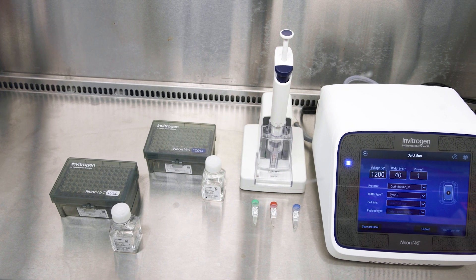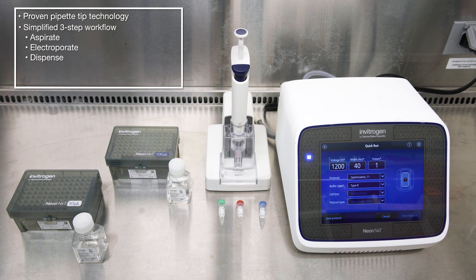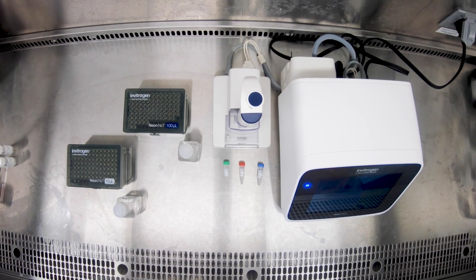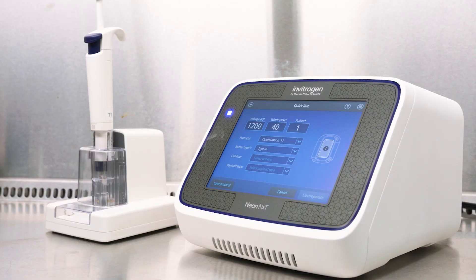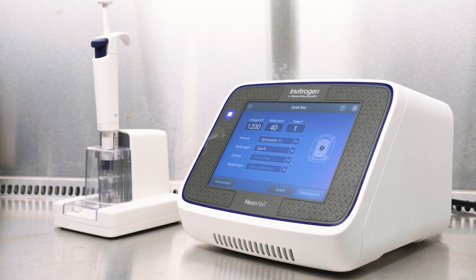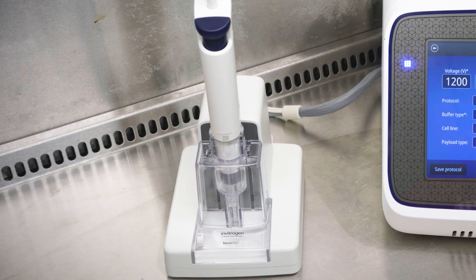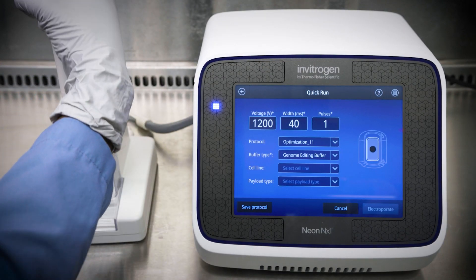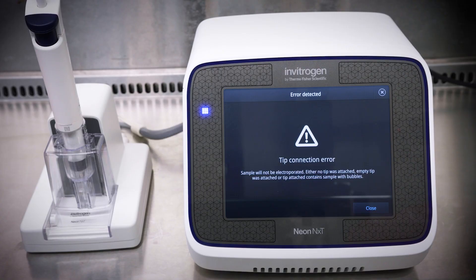The NeonNext Electroporation System takes transfection to a new level with its proven pipette tip technology, simplified three-step workflow, single buffer kit, and the flexibility to optimize your parameters freely. The system has several improvements over other transfection devices. For instance, the footprint of the instrument is small enough to allow it to fit into a hood, which helps to reduce the possibility of contamination. The ergonomic design of the pipette makes it easy to use, no matter how many cells you need to transfect. The system also has an improved feedback loop to deliver responsive and timely alerts that can help you minimize errors, which saves you time and sample.